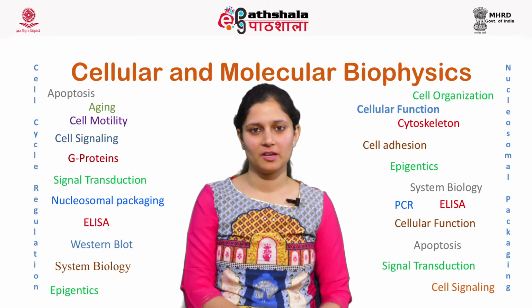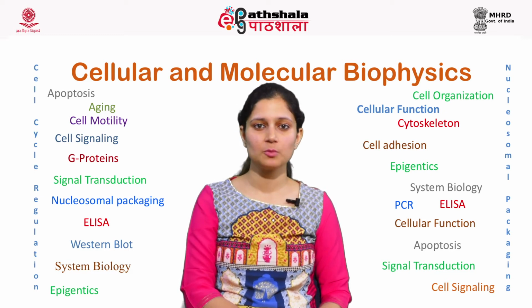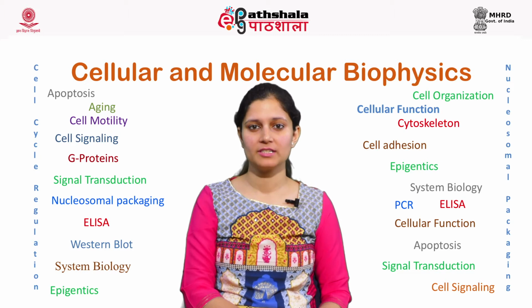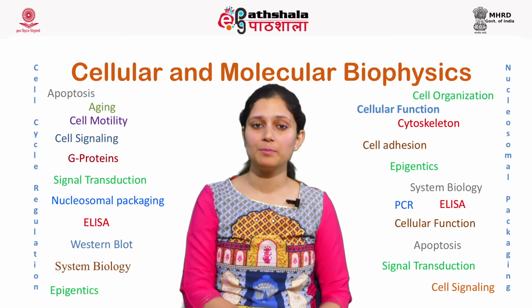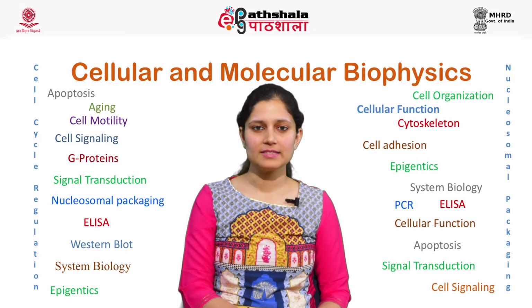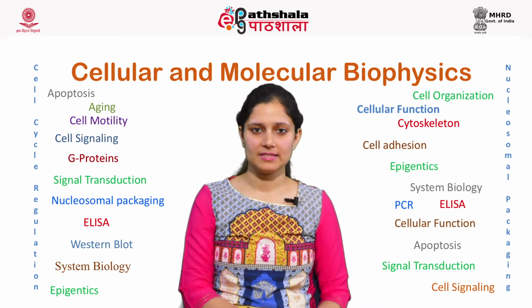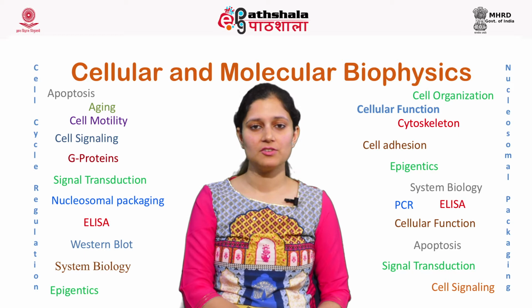Let us start the topic of polymerase chain reaction. Polymerase chain reaction is an enzymatic method of amplifying a particular sequence of DNA many folds in vitro. That is, this amplification takes place outside, in a test tube. As we can generate millions of copies of DNA, this technique is very useful for molecular diagnostics, forensic science, and in medical research such as cancer research and drug discovery.